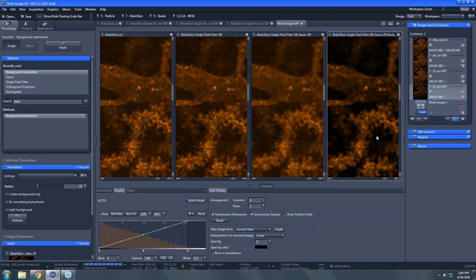And then we smoothed it out from panel 2 to 3. And this is where you have to make a judgment as to whether you can do this without losing some resolution. So we look at the tiny little features that are in this, and I think we've preserved them for the most part. We can still see pores where there look to be pores. And we've gotten rid of a lot of the single pixel variation that makes it look noisy. And then we've gone to a background subtraction.